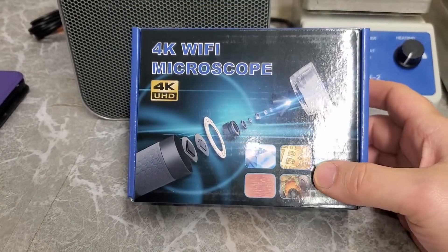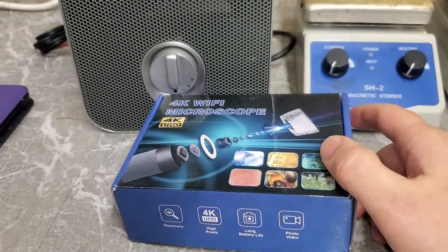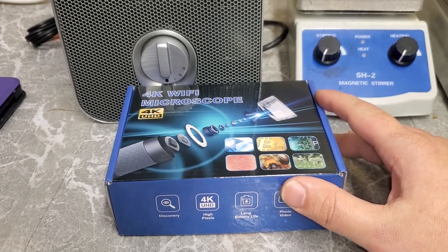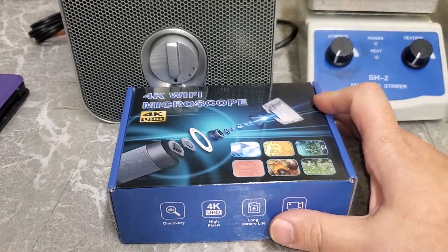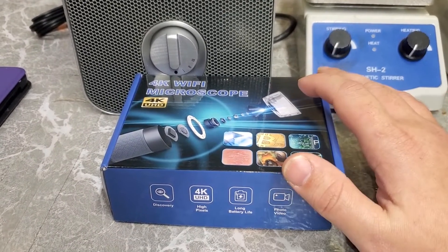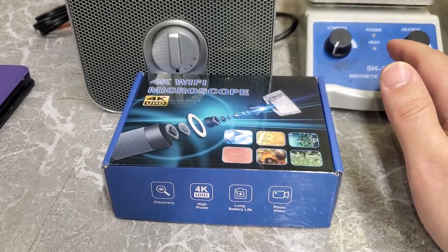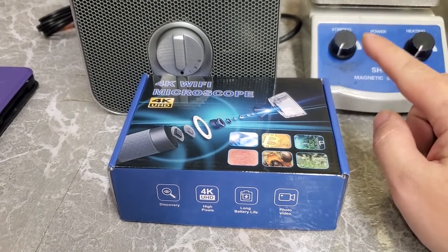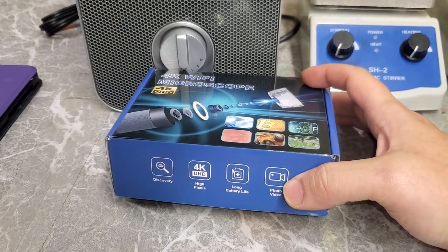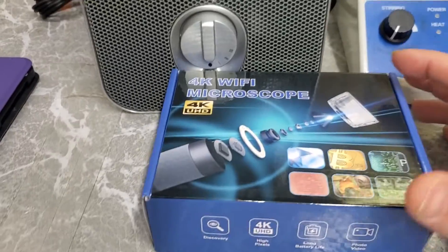I actually do have another Wi-Fi microscope somewhere. I think it's in my daughter's room — we were using it to look at different things and I just never got it out of there. It probably got buried in all her toys. So I wasn't too upset, because I wanted to get a new microscope anyway. The one I already had is only about 720p, and I've wanted a 4K microscope for a while. I got on Amazon last week and saw these on sale for $40, so I figured, why not?